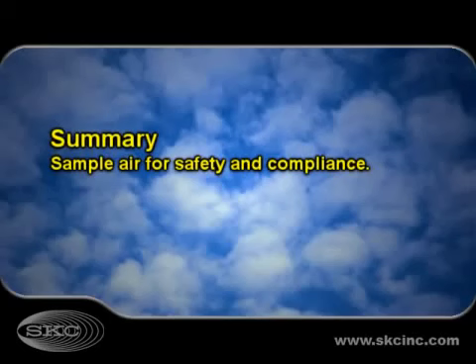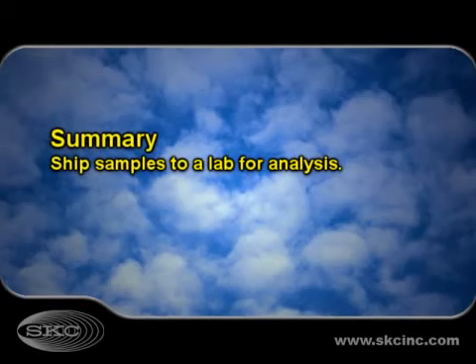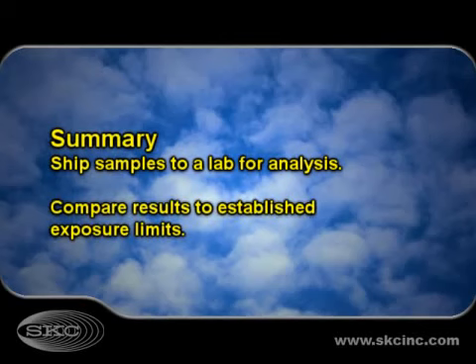In summary, perform air sampling for safety and compliance using a sample pump and sample media. Check the flow rate with a pump calibrator. Use a passive sampler if reliable sampling has been verified for the target compound. After sampling, send samples to a laboratory for analysis, and then compare results with established exposure limits.